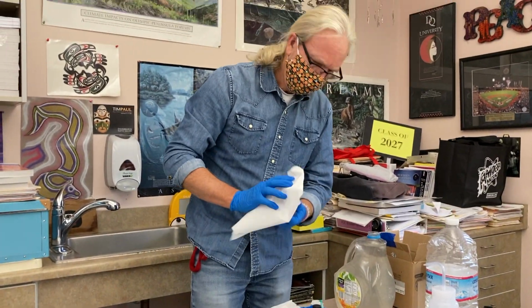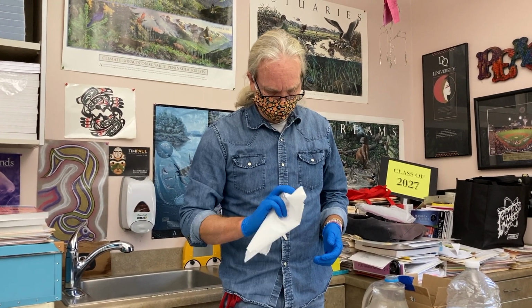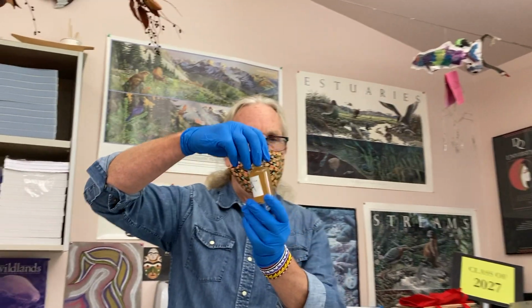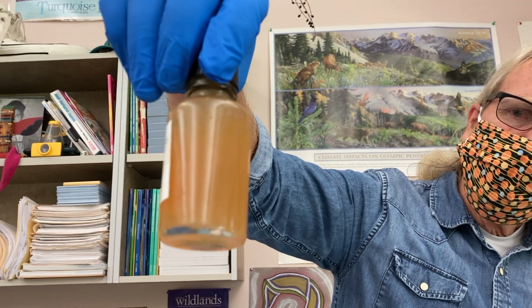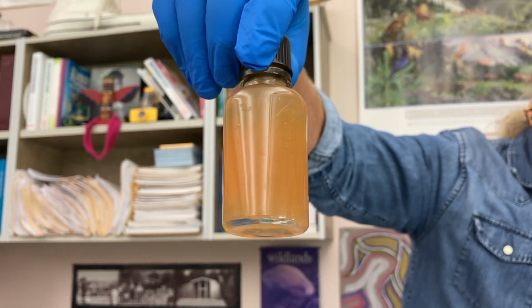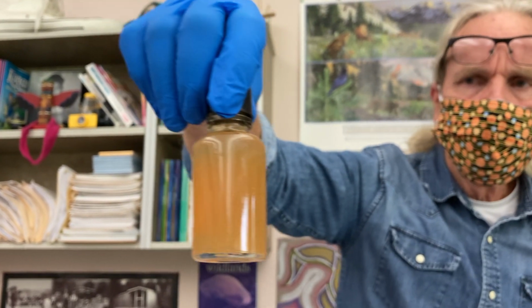So now we need to mix these 2 chemicals with the water and see what happens. Okay, it looks fairly mixed. There you can see a little particulate matter called flocculant. That's just the chemicals combining and forming a byproduct. So we're going to let that settle a little bit till it gets to the shoulder of the bottle. It might take a minute or 2. So let's do that.